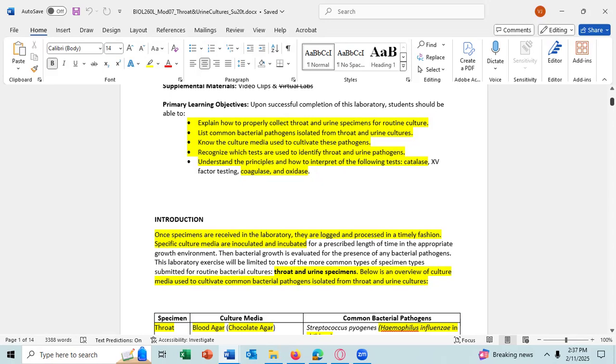We will be talking about the XV factor test, but you do not really need to understand it or be able to explain it.